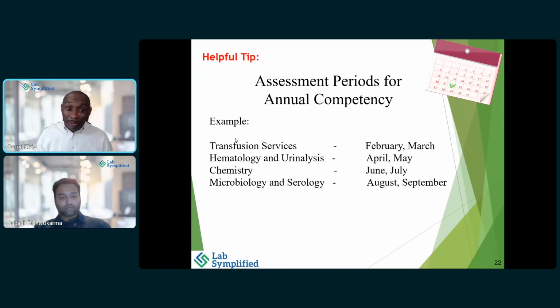Well, you don't want them doing the competency in blood bank at the same time as in hematology. It gets kind of crazy, especially if you're sharing your senior techs or the people who are responsible. Define some competency periods so it'll be organized. And this is just an example here of how you can have more. You can have molecular, and don't forget about it if you're responsible for blood gas or respiratory therapy.